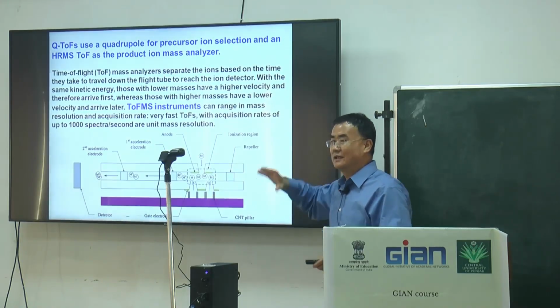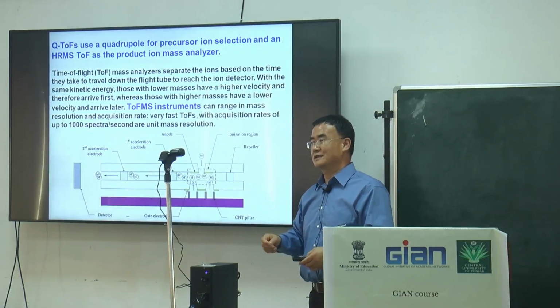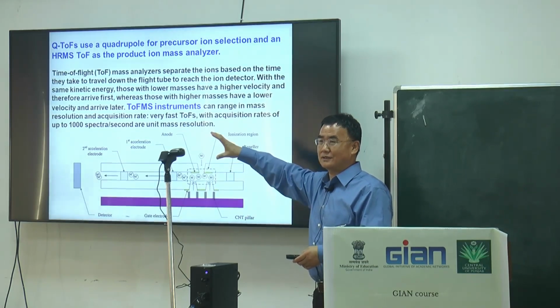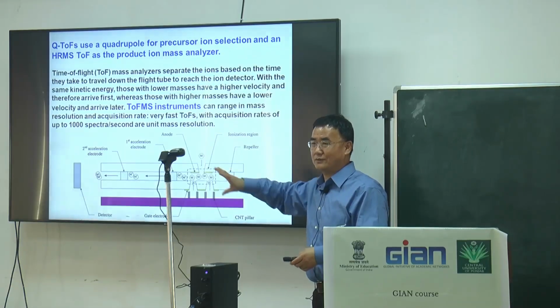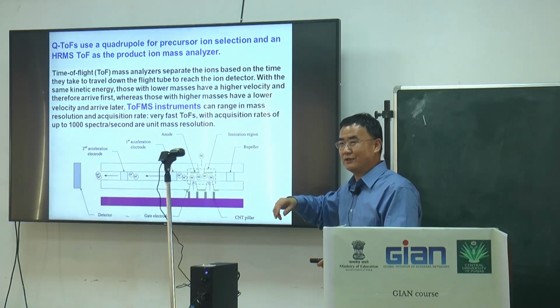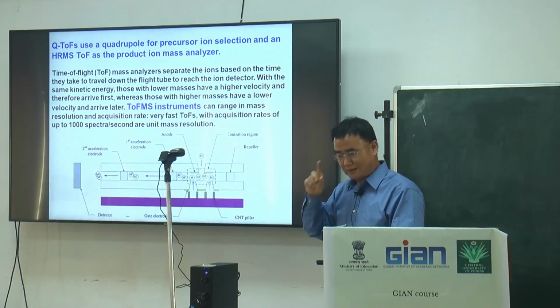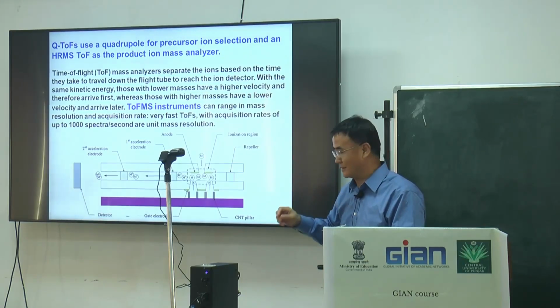This is very high throughput. With just one sample injection, you can get 100,000 metabolites. You also have auto sampling, where you prepare the sample. Later I will mention it, we will talk about it again.